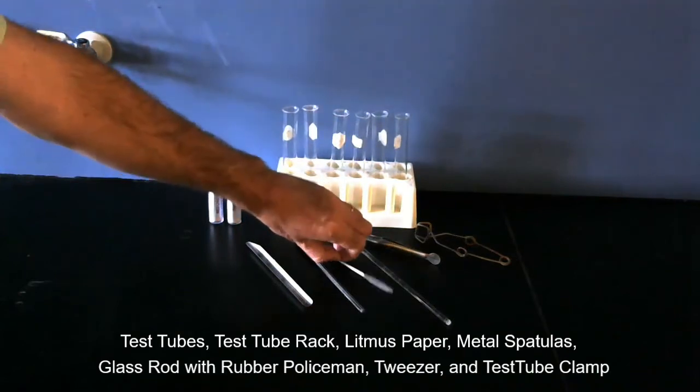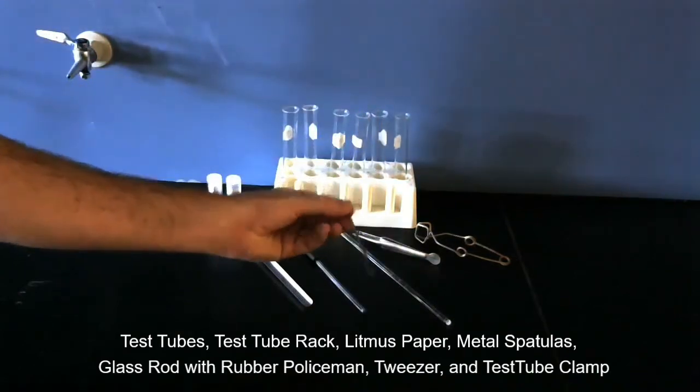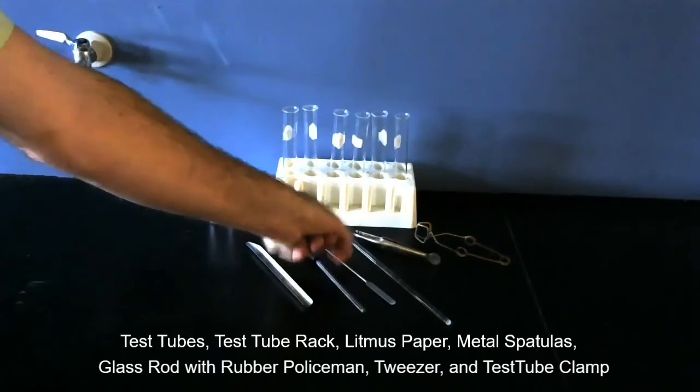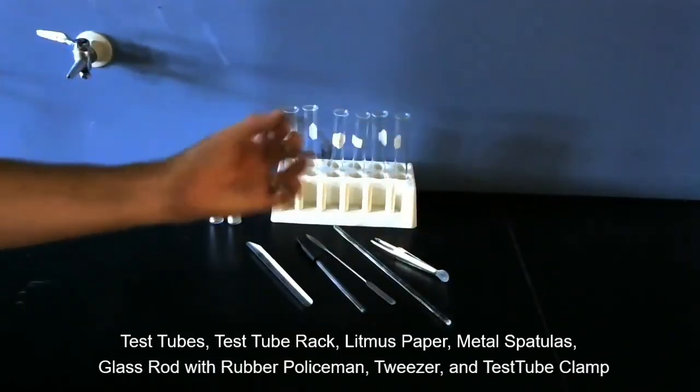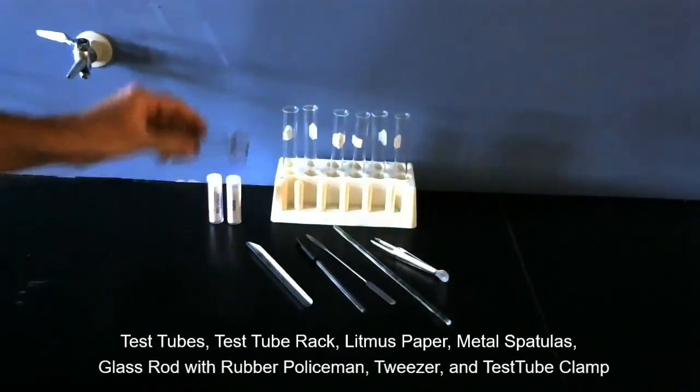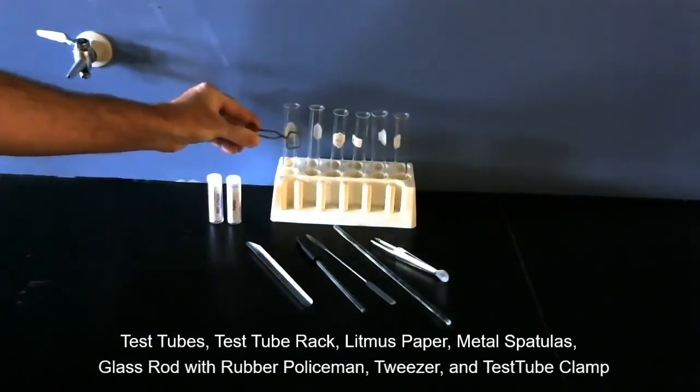Here's another little metal spatula for scooping solids. These are tweezers. And this is a test tube clamp that you would use for moving around the test tubes when they are hot.